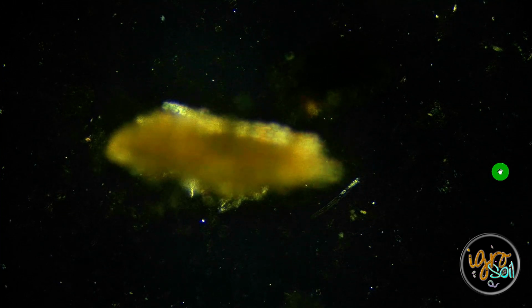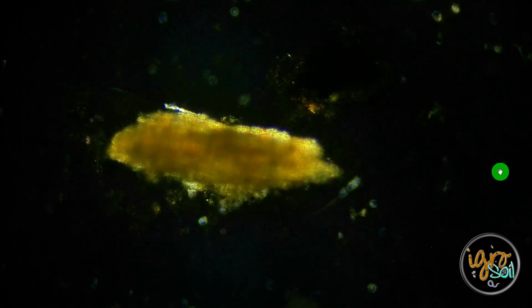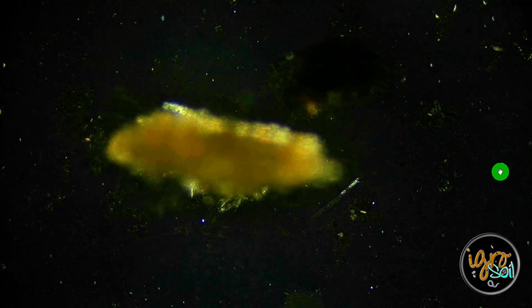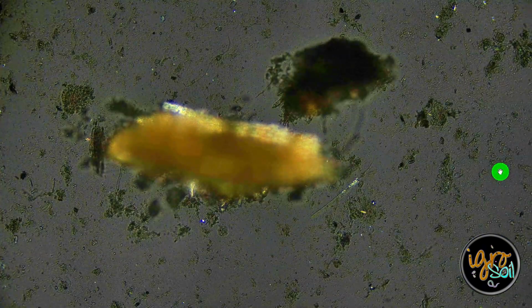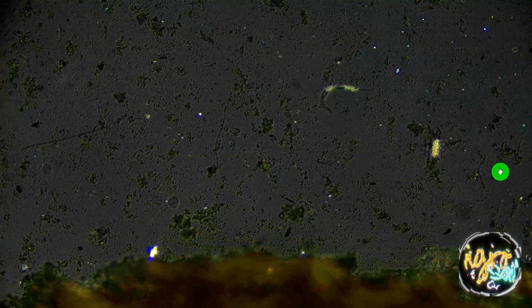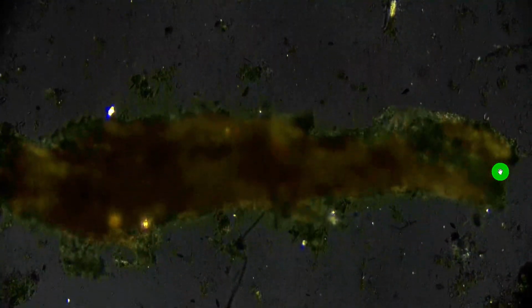But all of a sudden you light up, right? I can't tell you which minerals are what, but I can tell you that there's a lot glowing here. There's another nematode. See if we can dial them in a little bit. So whatever it's eating is what's glowing inside of it. This is what you get with mushrooms.